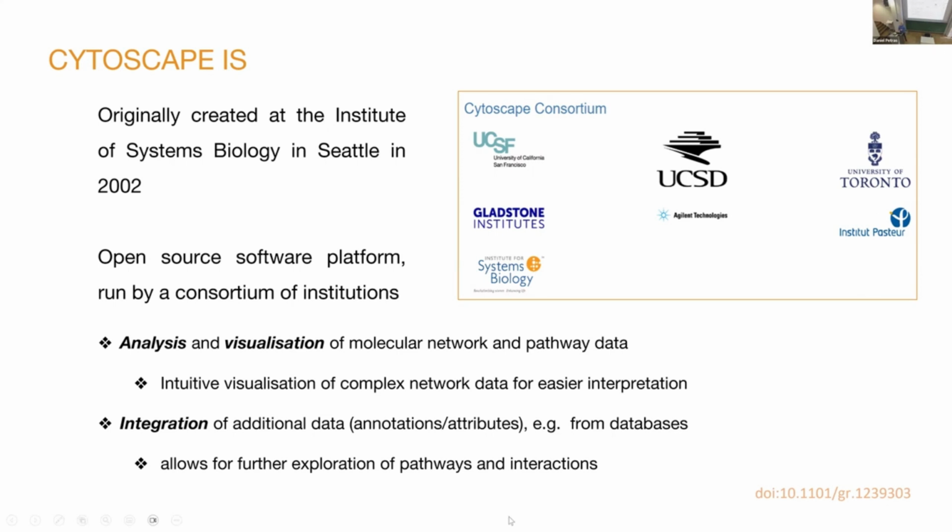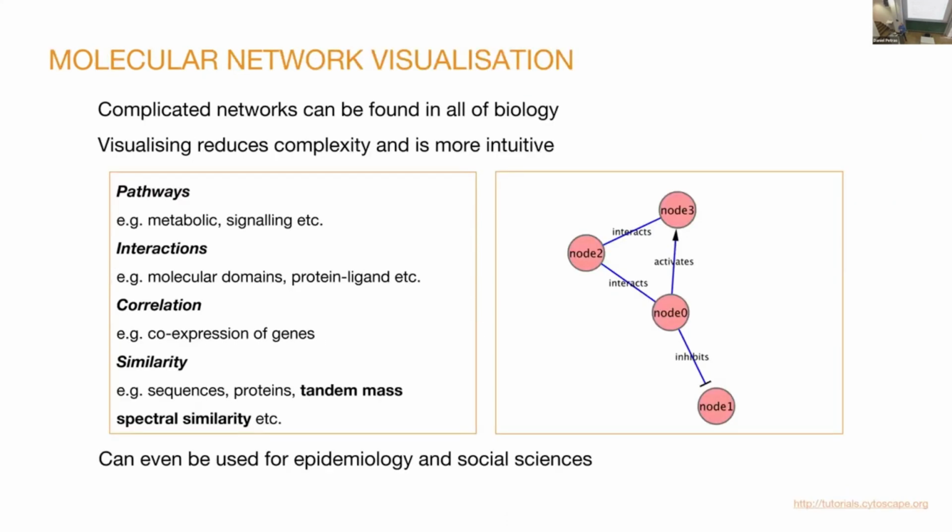Okay, great. So now, basically people use it for, I don't know, multiple visualizations, metabolic pathways, interactions, correlations, it's very common, and similarities, right? So in our case, we now want to show spectral similarities in those molecular networks. But I use it, for example, also to integrate my metabarcoding data or shotgun data and correlate ASVs and molecules.